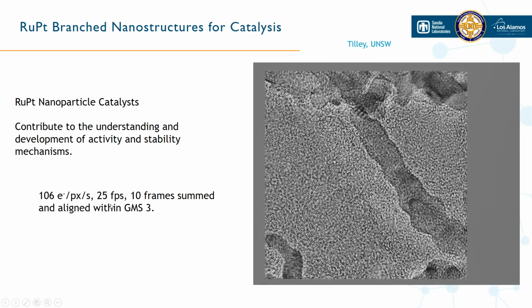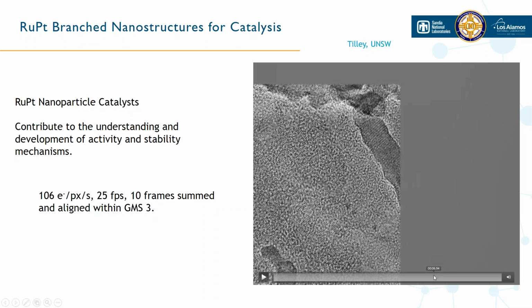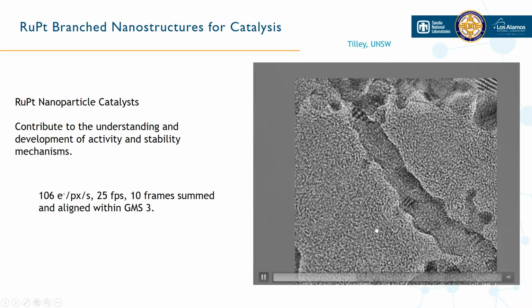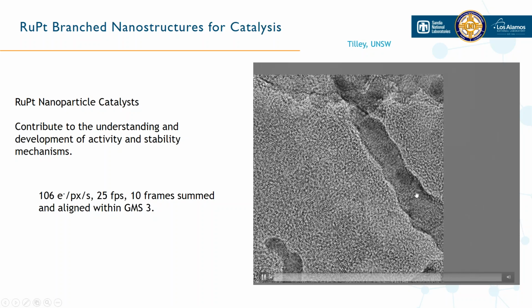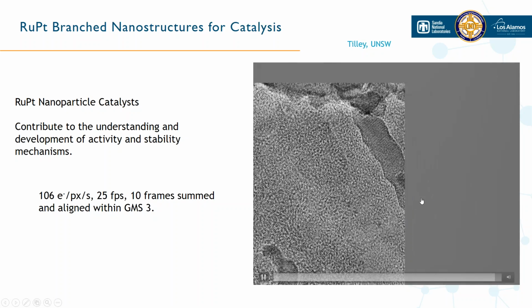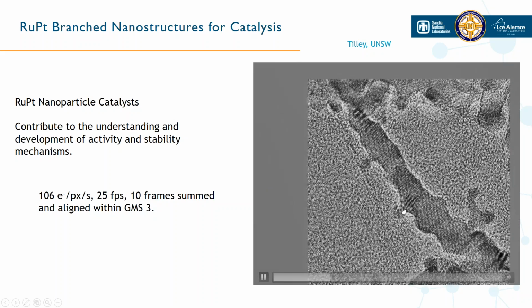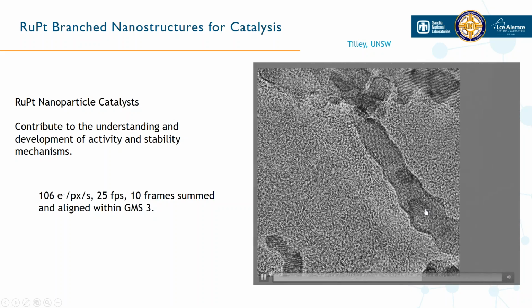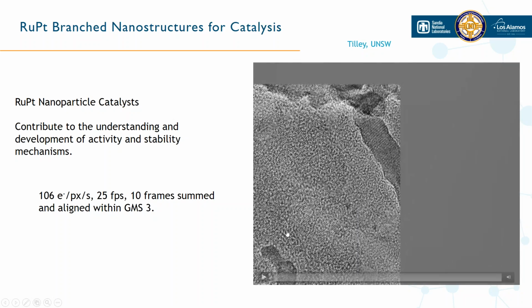And then when it's framed, that goes up to about 100. So what you'll see here is at a certain temperature, these platinum nodes are annealed into the branch. You can see that you have some defects at the surface. You get the emergence of these moire fringes as the sample turns and that node gets incorporated, and then eventually we end up with this single crystal.